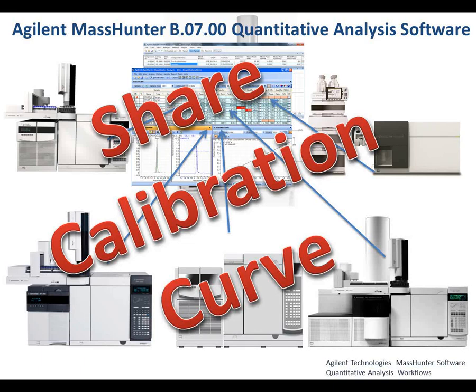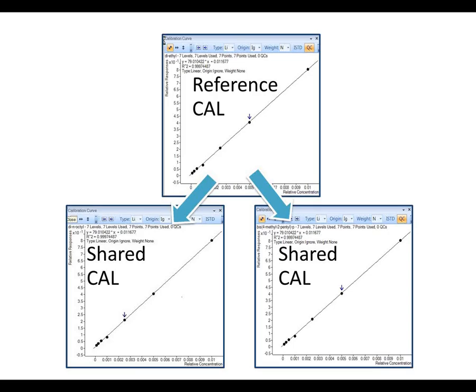Welcome to a discussion of sharing the calibration curve. The idea is simple. We're going to pick one compound as the cal reference, and then that curve, those response factors, will be inherited by other compounds, and we'll be sharing that calibration curve.